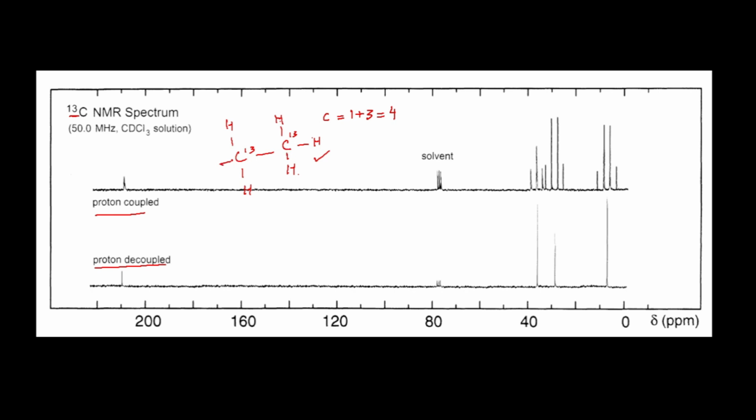You can also see this is also C13, and it will also give a peak in the C13 NMR spectrum, as this carbon is attached with only two protons. So one peak is due to the C13 and two peaks due to the attached protons. In total, three peaks will be due to this carbon.